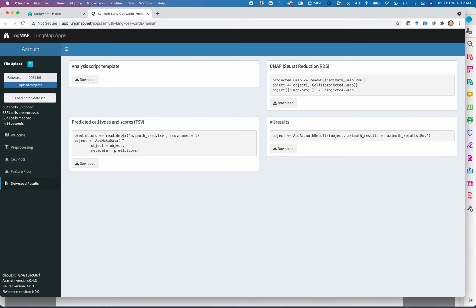You can download these results importantly, and people will want to download the cell association results where possible, so you can compare those results to the ones that you've generated in ICGS or wherever else.